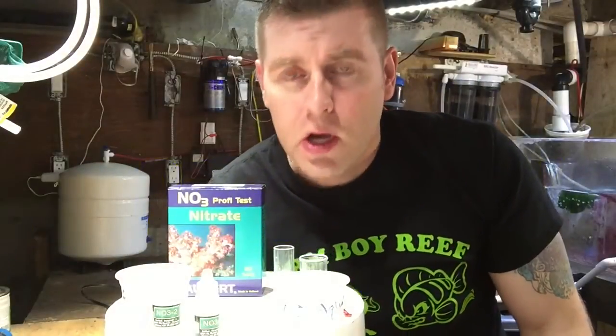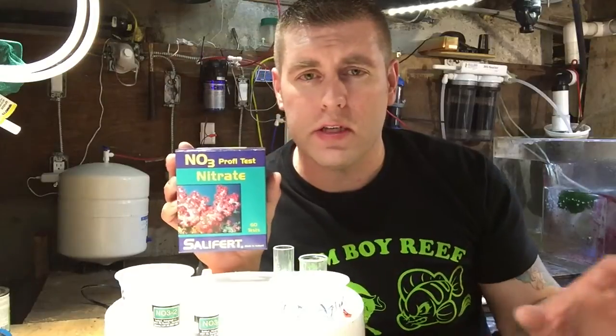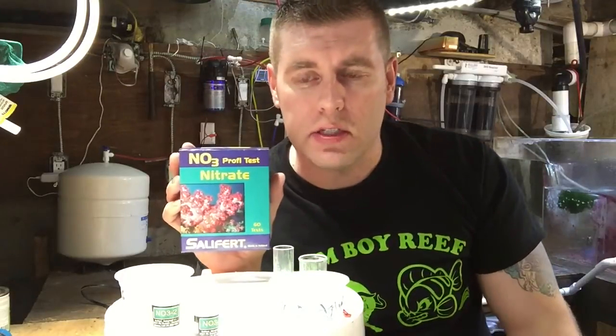How's it going today? Farm Boy Reef here. Today I'm going to show you another test from Salifert. It's a very easy test — like three steps. A lot of tests are four to five steps with charts and other mixing, but not this one.